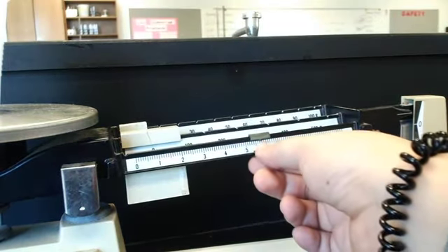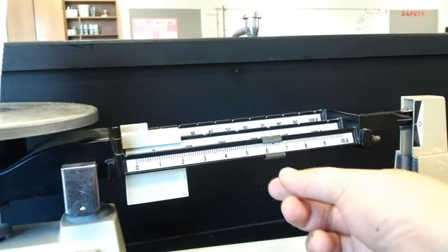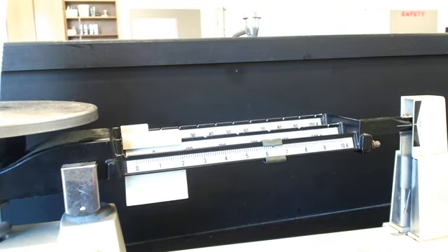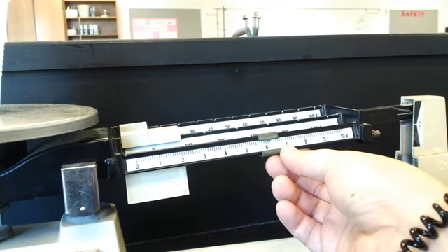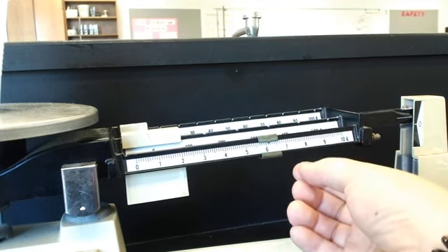Come over a little bit more. Okay. I'm going to say that is about right. Make sure that you have your known number plus your estimate.